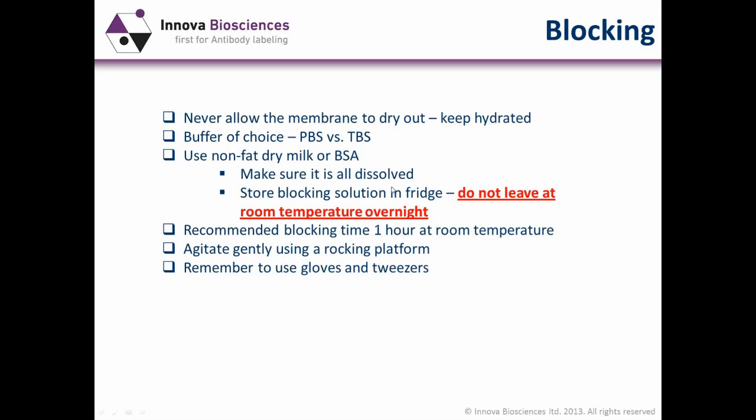And I cannot stress this enough: please make sure that all your buffers are dissolved properly. I've seen it time after time where people are in such a hurry to get on with their experiment.